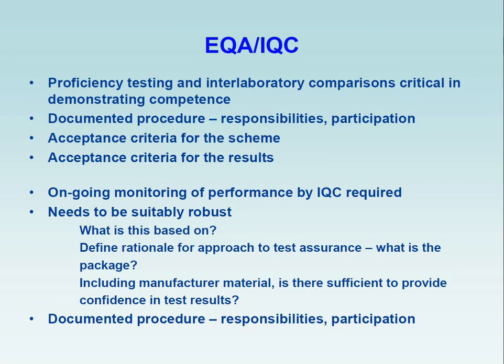EQA, IQC, proficiency testing and inter-laboratory comparisons are critical in demonstrating competence. I think probably growing up through CPA, that's probably a given. Documented procedure, responsibilities and participation. You have to have evidence of all of this. And you have to have acceptance criteria for the scheme and acceptance criteria for the results.